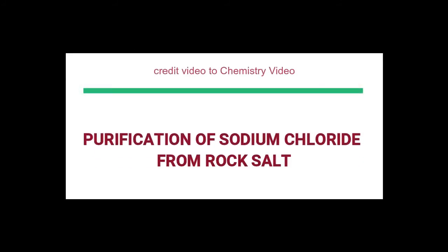The next experiment, the purification of sodium chloride from rock salt.